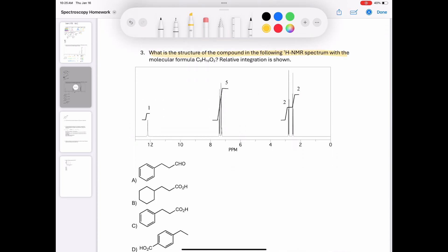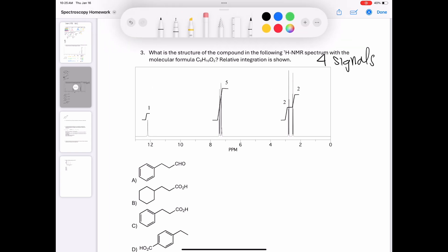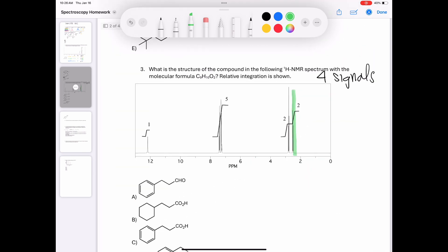Moving on to question 3: what is the structure of the compound in the following proton NMR spectrum with a molecular formula C9H10O2 with the following integrations? There are four signals corresponding to four unique proton environments. Going one by one starting on the far right, the first one looks like a triplet. I'll make a chart of the splitting, N value, integration, and shift to get a better idea of what each signal represents.